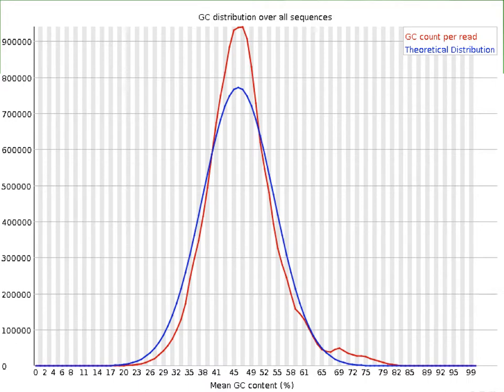The blue curve, called the theoretical distribution, is a model based on the data. It is a normal distribution modeled after the overall dataset GC content average and variance. It allows for assessing whether the red curve is different from the expected blue curve. Given that we have millions of reads, the authors take the assumption that the GC content should be normally distributed. Here, based on the difference between the blue and red curve, we probably need to take some corrective measures.